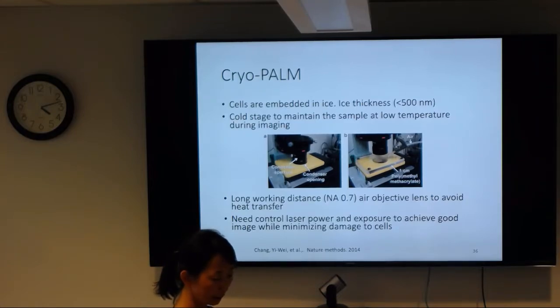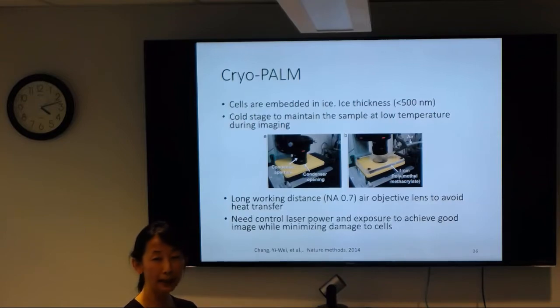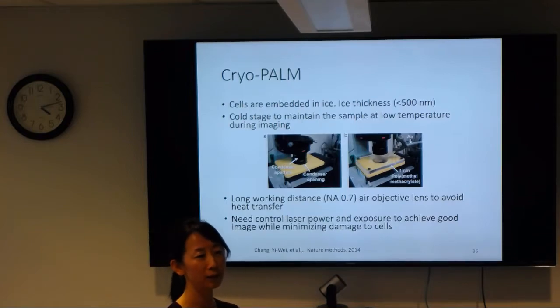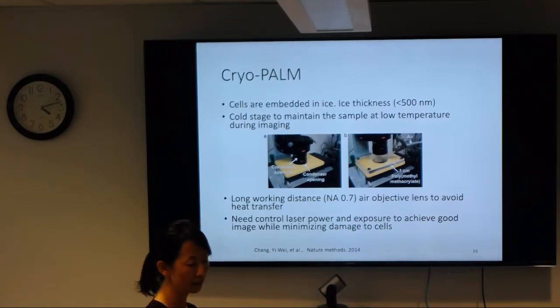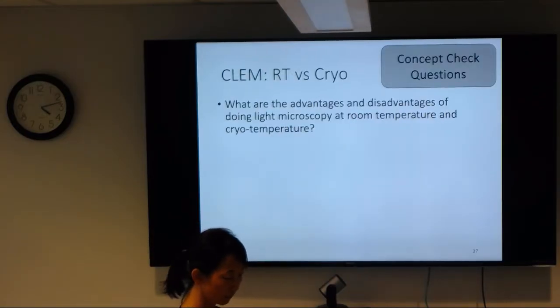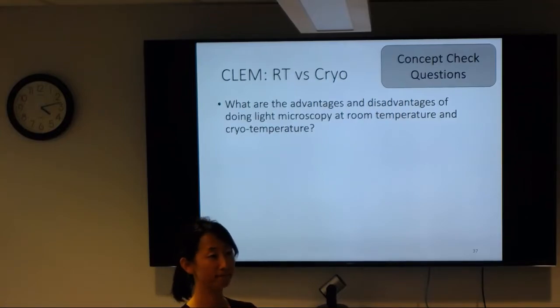Okay? And then they did some tricks to control the laser power to minimize damage. But even with that, the sample is slightly damaged compared to the result of this application. I will show that later on with one of their movies. So, room temperature versus cryo. What are the advantages and disadvantages?